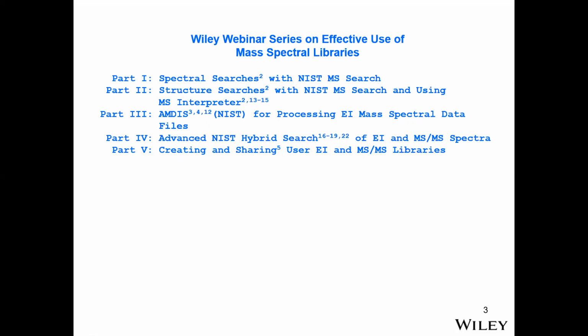I really didn't have enough time to talk about the MSMS libraries. The process is very similar. You might have to add some different tags to make it work properly. So I will just talk about the EI today.